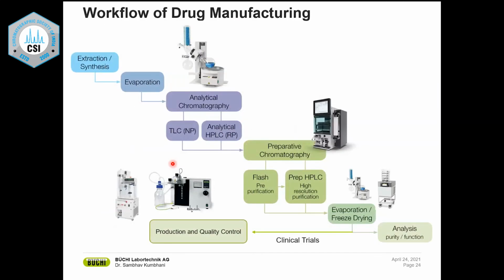All right. So now, I've told you a lot of story about how the instrument works, how it purifies. But you will ask me, where do I use it and why do I use it? So here's where and why. In a typical organic synthesis lab, you have multiple steps: step 1, 2, 3, 4, 5. You do all your reactions, and at the end you have some compound that you think you have prepared. But whenever you have your final step done, it won't be a ready-made solid compound. It'll be dissolved in some kind of solvent.